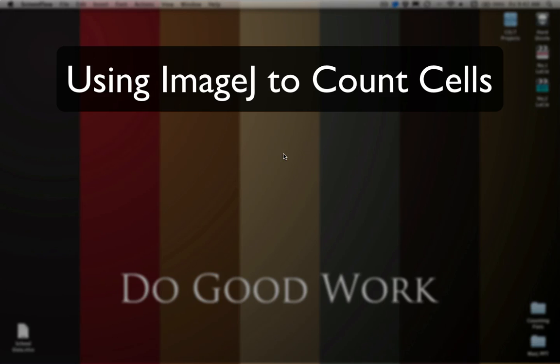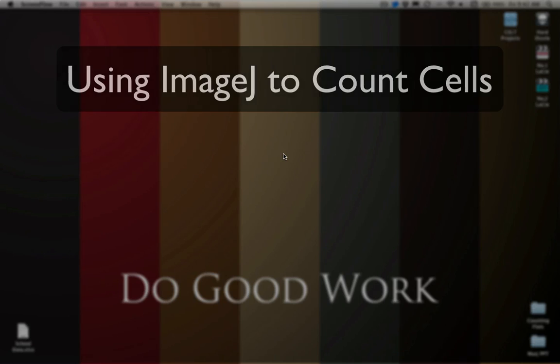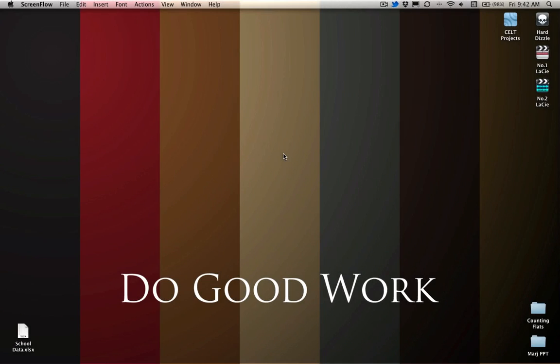Hi there, Keen State Bio. I'm going to give you a couple of specific examples of how to work with ImageJ. I know that these are very specific examples so it might not be helpful in a lot of different situations, but hopefully you can apply some of these concepts in a couple of different ways.